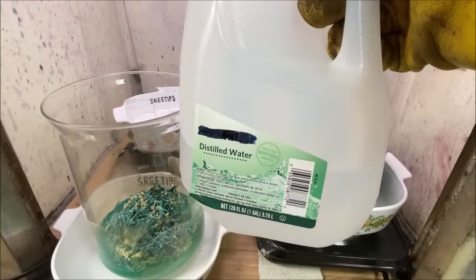And now we're going to set this up on the heat and continue dissolving out the copper. I'm adding dilute nitric acid here. It's 150 milliliters of distilled water with 50 milliliters of nitric acid, and I just add it slowly, a little bit at a time. And I'm noticing now that there's very little fume production.